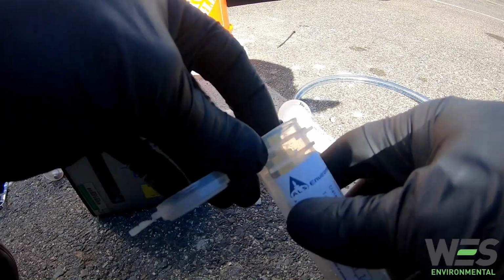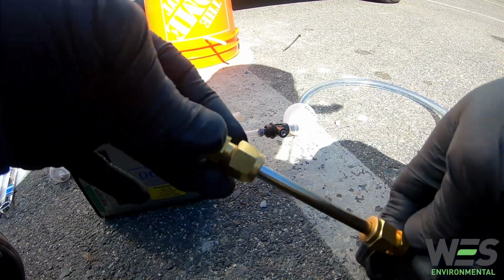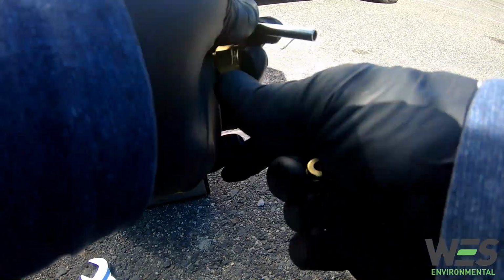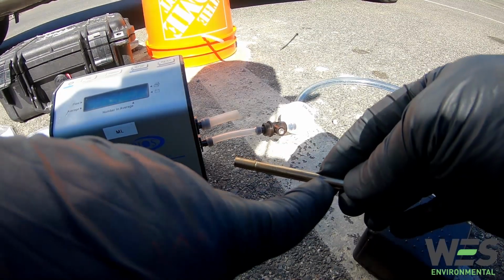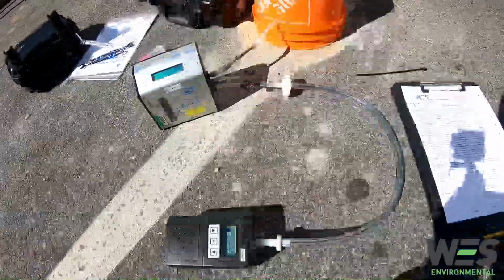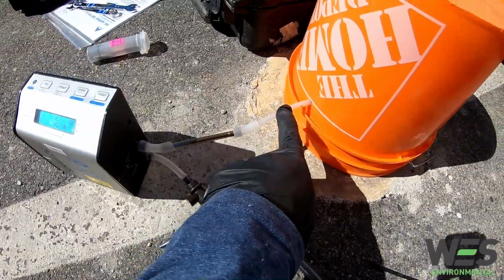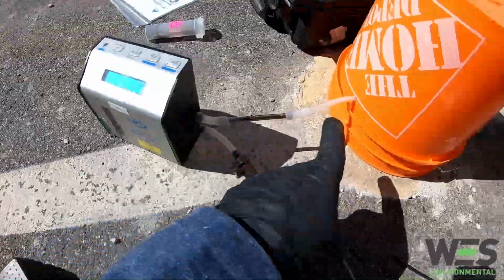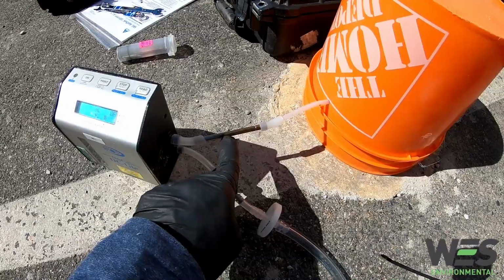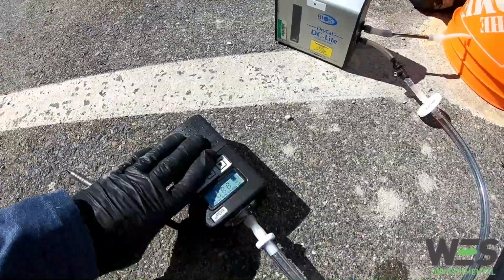Here we've got our proper TD tube, and it's got clamps on the end to make sure it's good and fresh. So I can take the ends off. Same thing, gonna check for the arrow, make sure I put it on the right way. Here we're all set up. TD tube in between the probe tubing and the dry cal, so that when the air sucks, it goes into the TD tube and we collect whatever we're gonna collect from the soil vapor probe. And then the pump is here, so nothing's on.